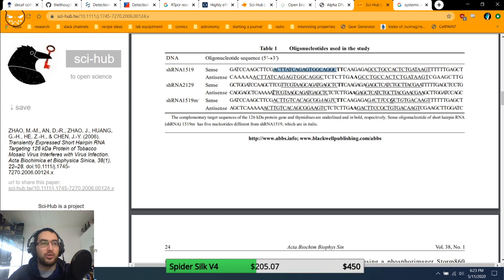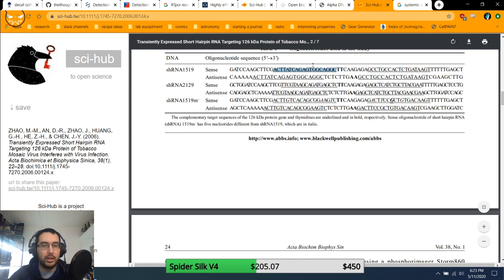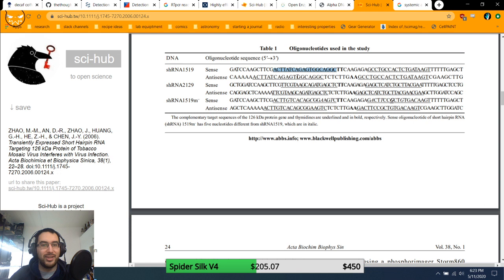So basically, once we're done designing this targeting sequence, we're going to talk about how I'm going to actually make this. Because like I said, I'm actually doing this. This is not theoretical. The reason we pre-chose this one is because I'm doing this and it should only cost me like $30 or $40 worth of materials in theory, fingers crossed, but we'll get there.